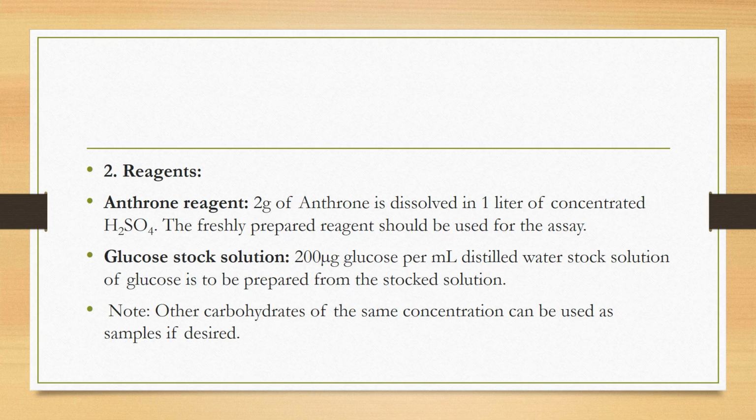So this is the stock glucose. We will take the samples from this stock. Okay. Note, other carbohydrates of the same concentration can be used as samples if desired. You can use other carbohydrates, but of the same concentration as this stock solution. Okay.